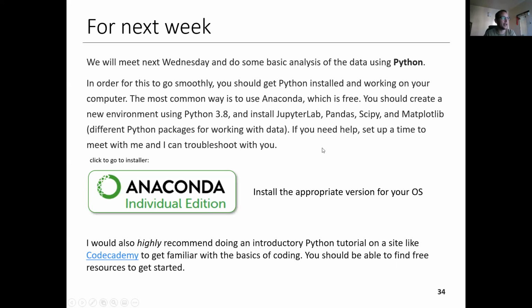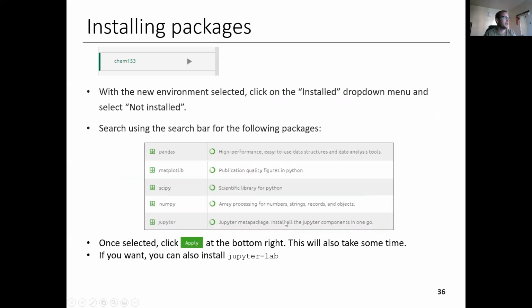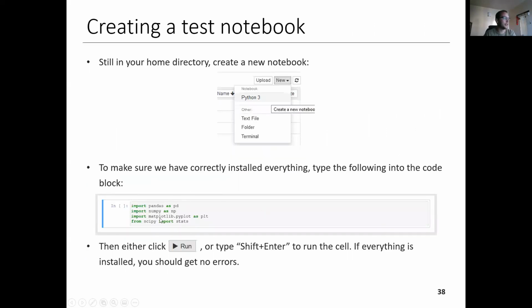So I don't want to spend a lot of time going over that really basic stuff in Python. Not basic in the sense that it's like beneath anybody. Obviously, you need experience to do this stuff, and it just takes time getting used to it. But if we have to spend a lot of time showing how to print things and add numbers, we won't get to the actual data analysis. So we're basically going to start from using Pandas to read in CSV data. And then there's some slides here that'll kind of guide you through how to set up an environment for doing this analysis. I'm not going to go through them now. You can download this and work through it on your own time. These are the packages that you'll install. We'll open up a Jupyter notebook, blah, blah, blah, and then run some test code to make sure that everything is working correctly.